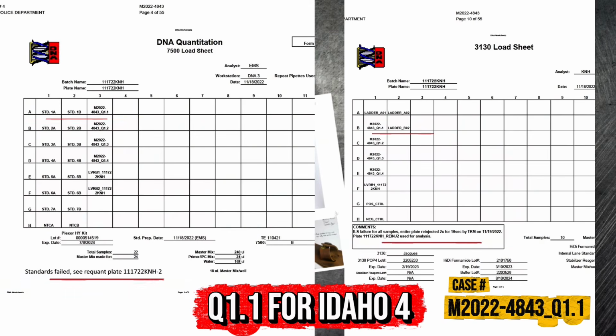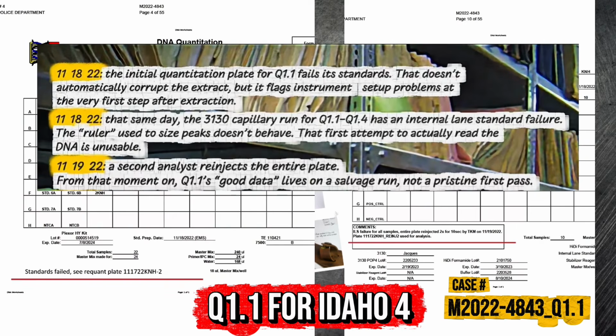The story for the Q1.1 extract actually goes like this, under case number M2022-4843, 11/18/2022. The initial quantitation plate for Q1.1 fails its standards. That doesn't automatically corrupt the extract, but it flags instrument setup problems at the very first step after extraction.